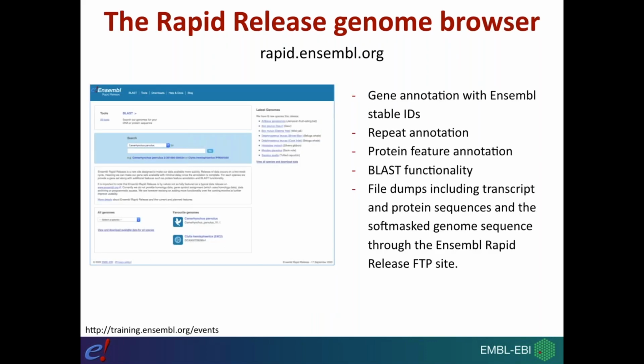So that's why we've launched the new Rapid Release Genome browser. So the idea with the Rapid Release Genome browser is that it's a lightweight genome browser that contains a small amount of very important data for newly sequenced species.